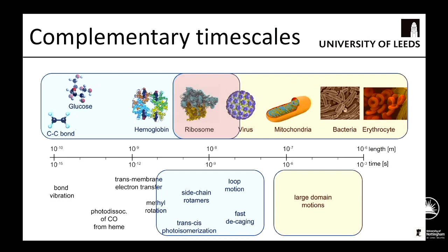Actually, time-resolved electron microscopy is very complementary to what they're doing in the XFEL beamline, because what we can do in time-resolved electron microscopy is look at large domain motions. So here we're talking about millisecond, microsecond motions. Things like the ribosome in action, viruses decapsulating to release the cargo, for example. So all these lovely molecular machines that you can get in biology, we can start to trap them in different distinct states in the millisecond and hopefully the microsecond time frame, and hopefully to close to atomic resolution using the EM tools available to us. So this is the area that we're looking at.